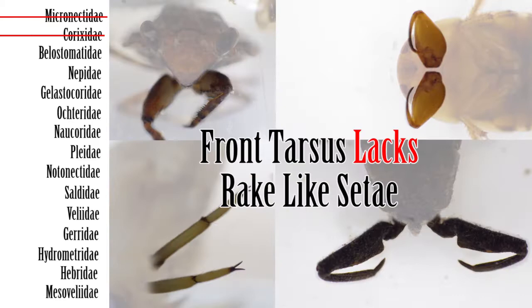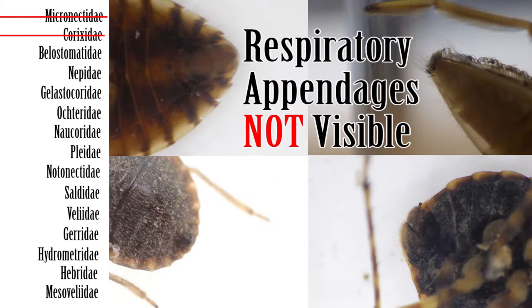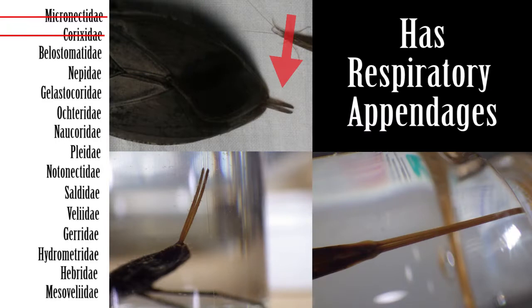Step 4: If the beak is not triangular and the tarsus lacks rake-like setae, next check the apex of the abdomen. If the apex of the abdomen has respiratory appendages, then move on to Step 5. If the apex of the abdomen lacks respiratory appendages, move on to Step 6.